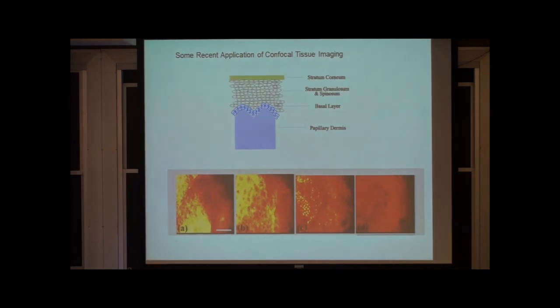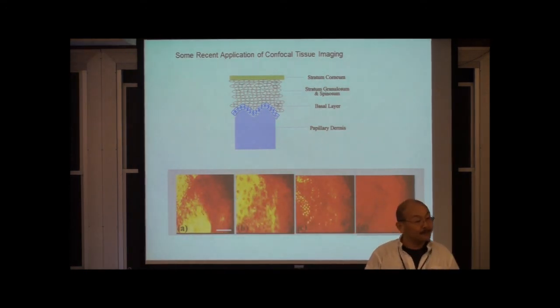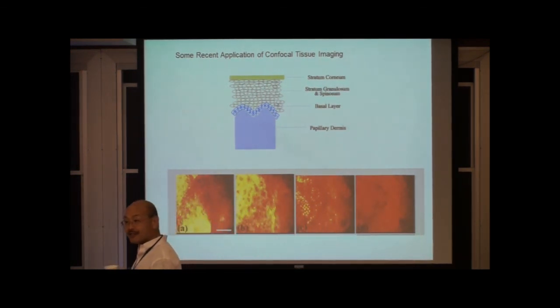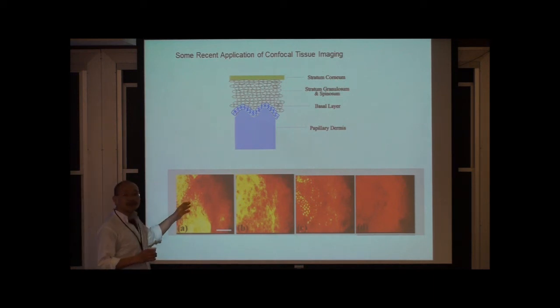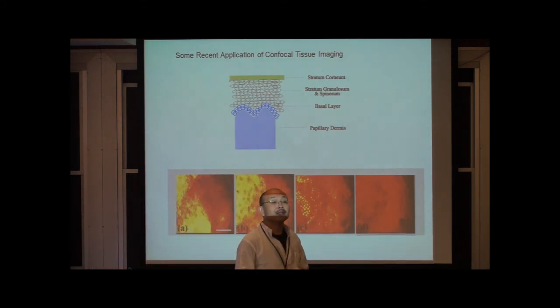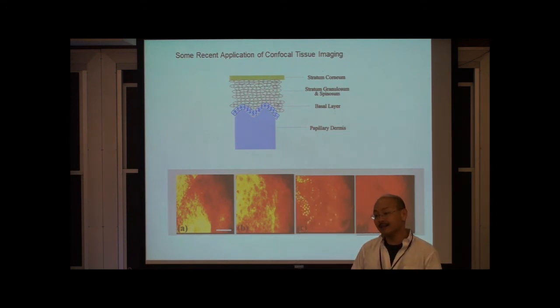So, today there are many things that you could image with this sort of system. One of the things that confocal works very well on are systems that are relatively transparent and not too thick. So if you want to map the three-dimensional structure of a cell, or if you have a cell in a relatively clear matrix, confocal works quite well. In some cases, you can also push confocal a little bit and go into more turbid specimens. For example, today there is a company developing a confocal microscope for the diagnosis of skin cancer called Lucid Instruments.